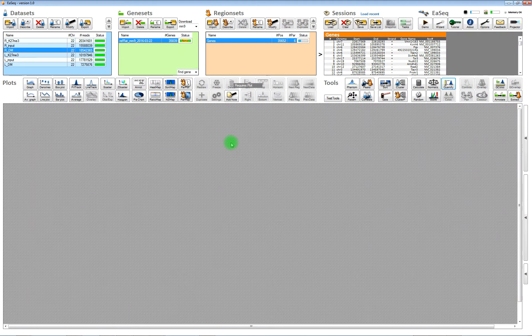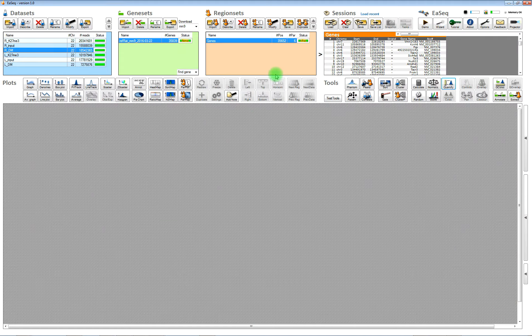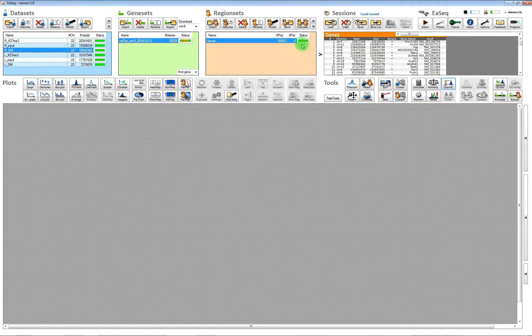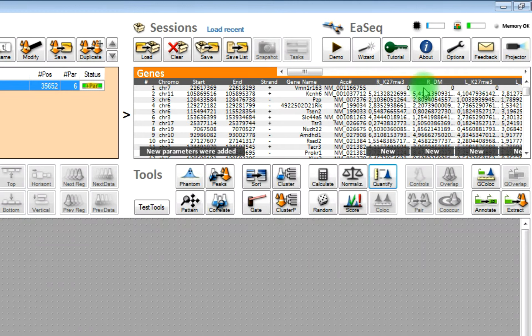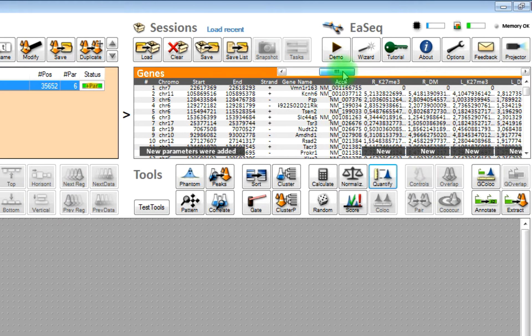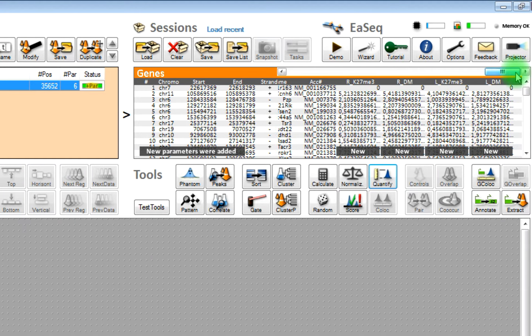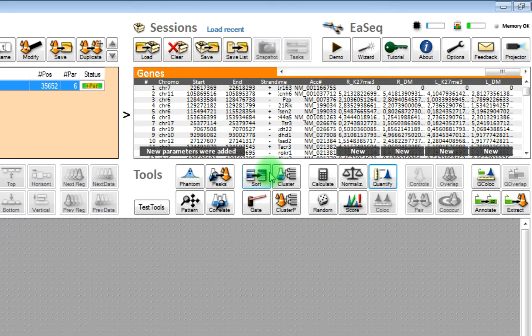So now we start the quantitation. It takes a few seconds and then you can see the new quantified values as new columns here in the region set. New parameters.